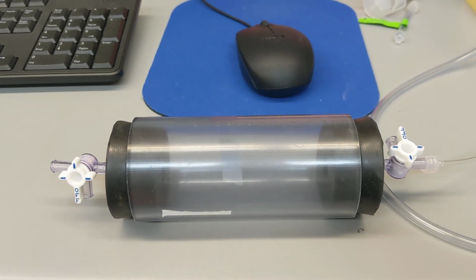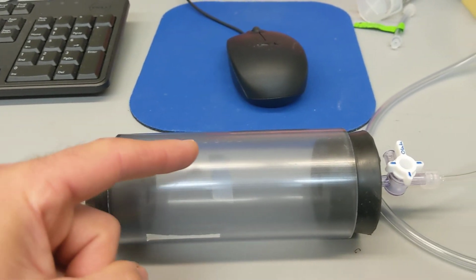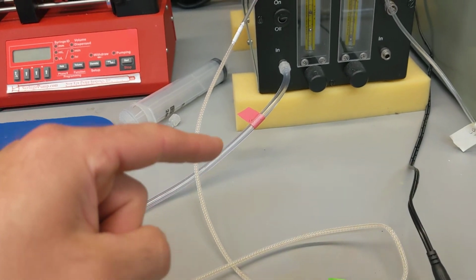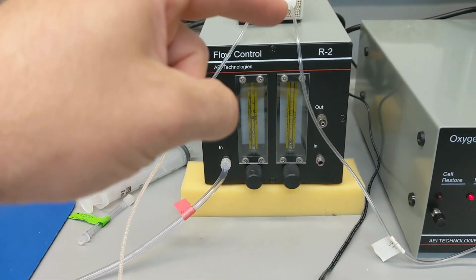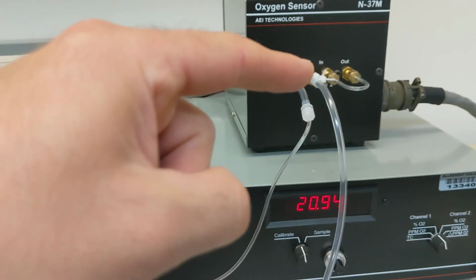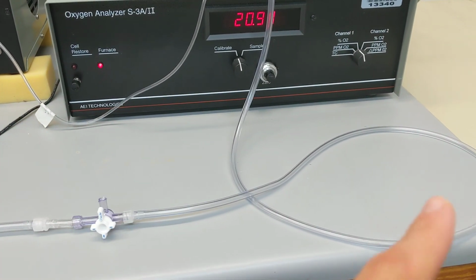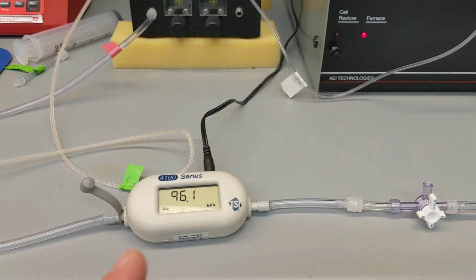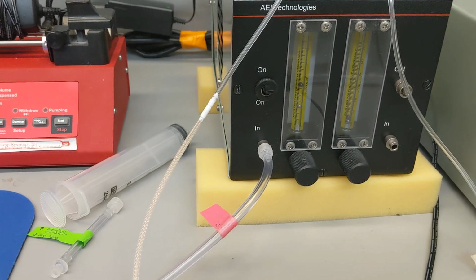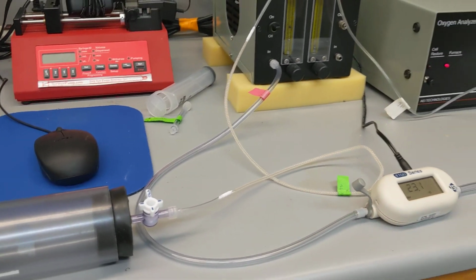So all that tubing is generating suction, pulling air from this sample through this airtight chamber, around this tubing, it comes up, it gets dried, air is continuing this way, it's going into the chamber, being analyzed, coming down, coming this way, measuring the flow rate as it gets pulled this direction, right? And then tracing it back to our air pump, which is doing all of the work. So that's a basic setup of this.